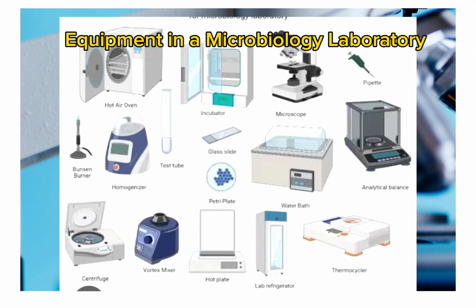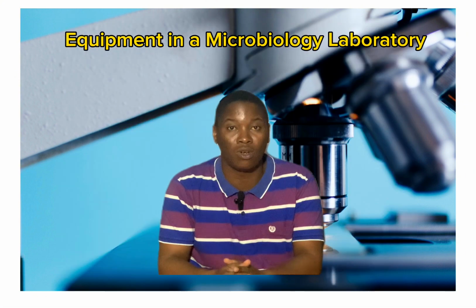This is just some of the tools that are used in the microbiology laboratory. The microscopes, stains and dyes, growth media, which can be solid or liquid media, the petri dishes, the test tubes, the Bunsen burner, and last, the inoculating loop.